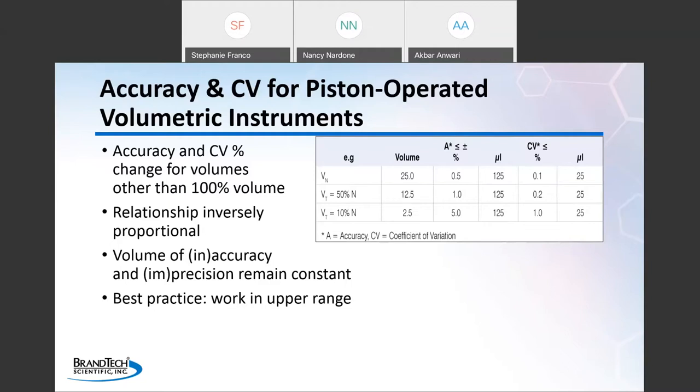You should see a poll question on the right side of your screen. We'd like to know, who does the calibration for liquid handling instrumentation for your lab? Is it A, an offsite calibration facility, B, internal calibration group or lab, C, a vendor that comes on site, or D, you do your own calibration? We'll give everyone a few moments to answer.